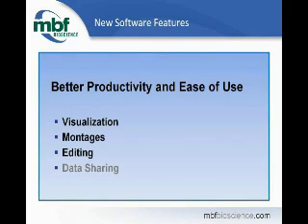So now let's move on to the pure software. We want to increase your productivity and make our software easier to use. Some of the things that we've spent a lot of time and effort on include improvements to visualization, image montage creation, editing, and data sharing. And we hope that many of these will find their way into your hands and your lab so that you can get your data faster.